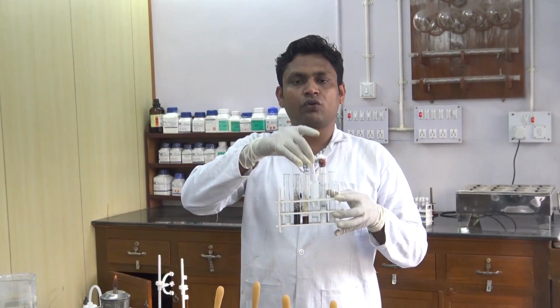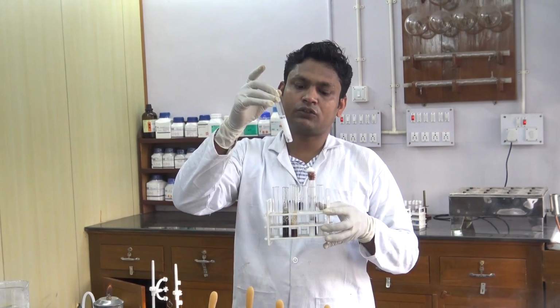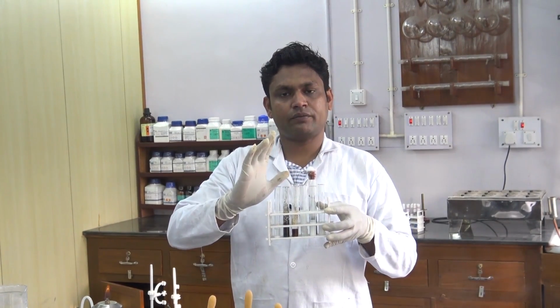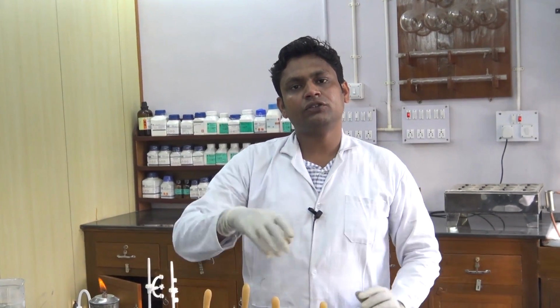If we have group 3B precipitate, then we have to test for the group 3B cations, not for 1, 2, 3A, 4 or 5. Like this, we have chosen some basic cations for our confirmative test.